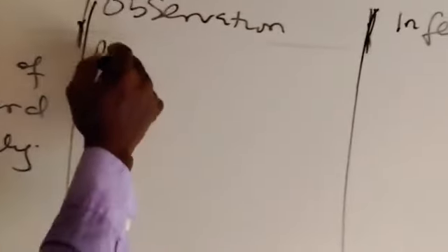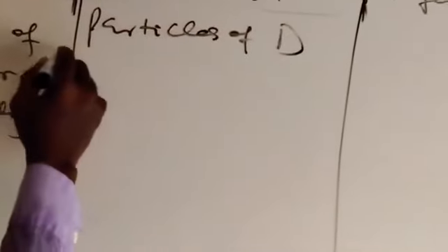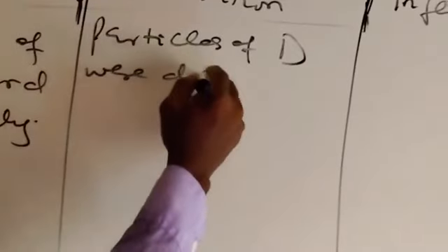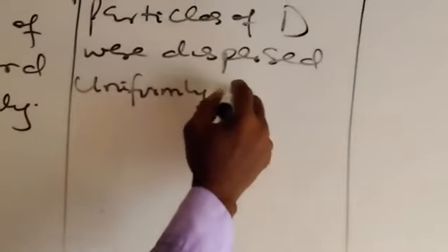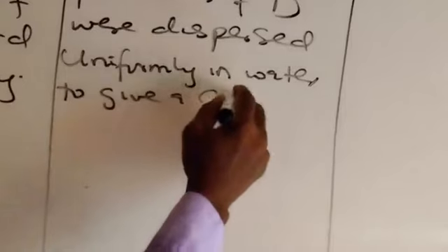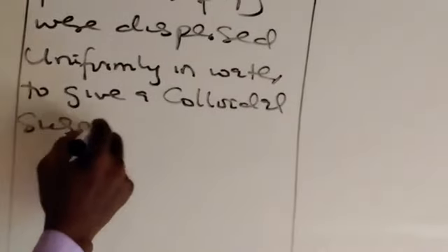So let's report our work. Observation: particles of D were dispersed uniformly in water to give a colloidal suspension.